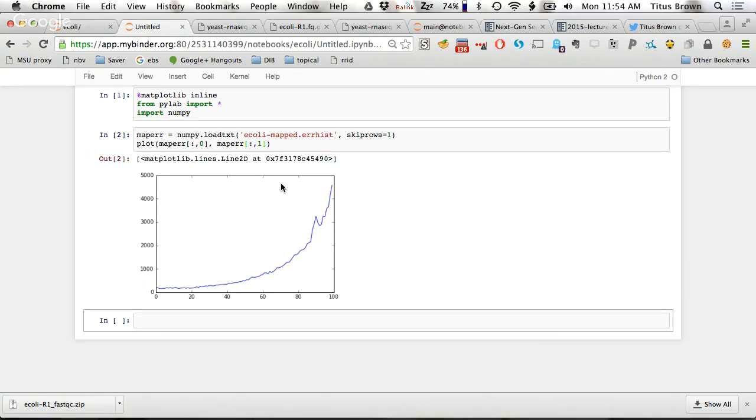So the other thing, does everybody get what we're doing here with the mismatches and why it's interesting? Are there any questions of this? So this is an empirical statement about where your reads are not matching your reference with respect to position within the read, generally from sequencing error. The only problem with this is that you need a reference. If you're sequencing something new, then you can't look at it this way. Although you could assemble a reference and then look at it this way, but if the assembled reference is biased by the errors in your reads, then that causes trouble.